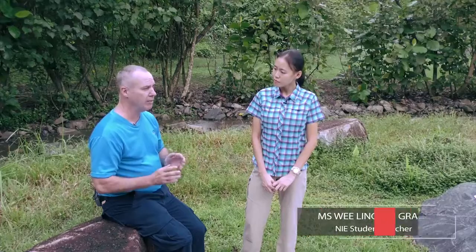Today, with Grace we will examine the environmental importance of pH and also how to measure pH. pH is one of the most commonly measured environmental parameters that we see, and that's mainly because it's very important as far as water chemistry goes, but it also has an impact on aquatic organisms. In addition, it's relatively easy to measure and it can be measured fairly inexpensively.